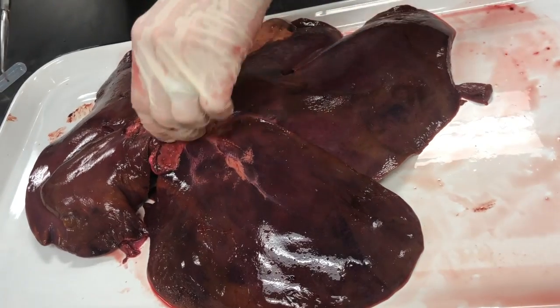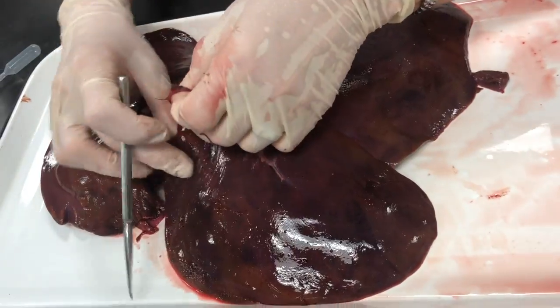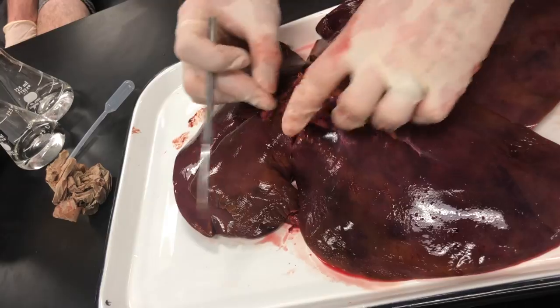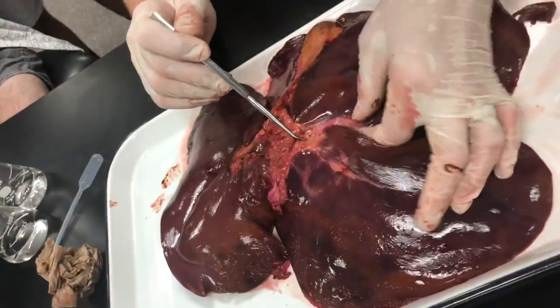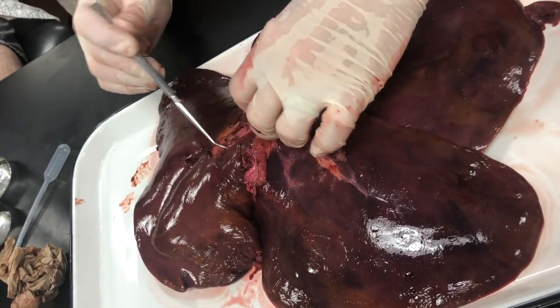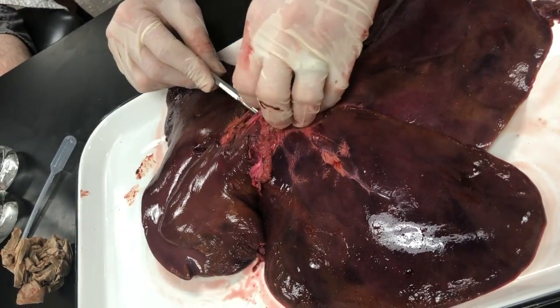And so, on this one I can see a little fat, and if I dig around, I may be able to find the openings to things like my hepatic artery and my hepatic portal vein. So, I'm going to look for some blood vessels, and they're kind of in this fat stuff. And if I can find an opening, I can probably get in there. So here's a little opening that was cut.